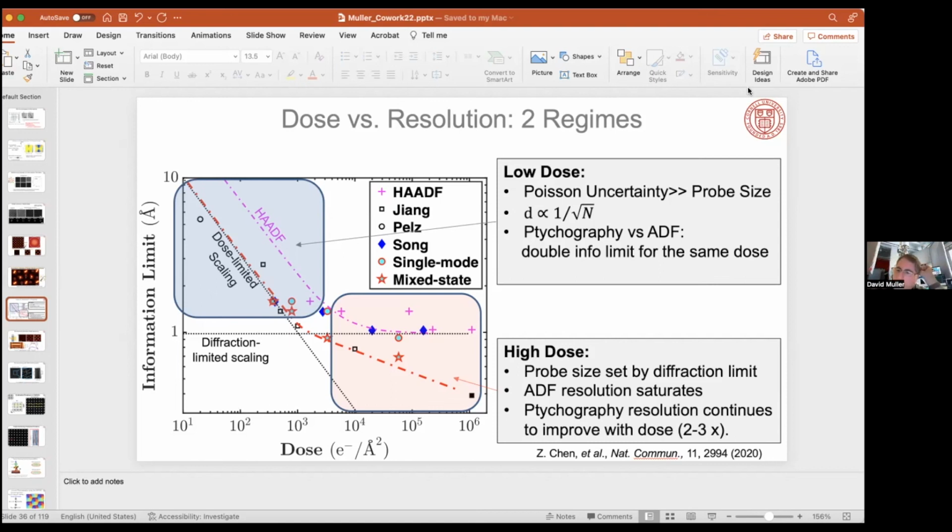I'd say our biggest obstacle right now is the time taken for the reconstructions. It's not the reconstruction itself so much as tuning the parameters to get the best reconstruction. So Yi has written Gaussian processes to do Bayesian optimization and search all the parameter space to tweak that up. One of my postdocs wrote a multi-parameter, multi-objective version of that as well. We bought ourselves a very large cluster, with terabytes of RAM and I think 320 gigabytes of GPU. We use that to run many reconstructions to tune our parameters and see which one is giving us the best reconstruction.